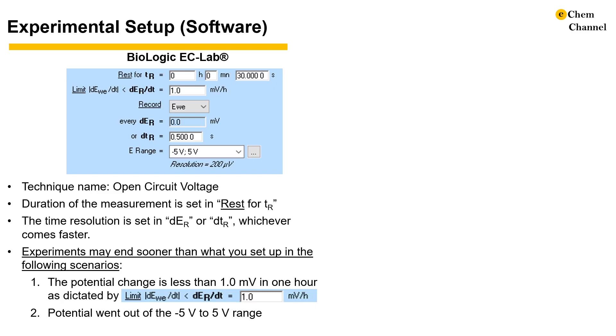It has occurred to me that OCP measurement can be shorter than what I set up in the software. Most frequently, it occurs due to the default limit of a potential change of one millivolt per hour being reached after the system reaches equilibrium.